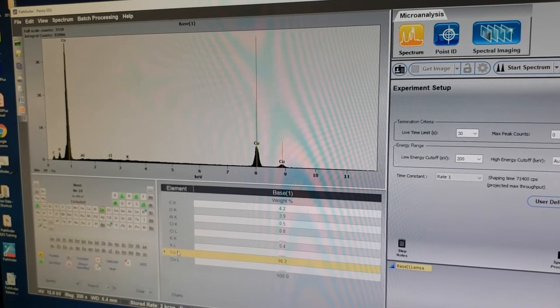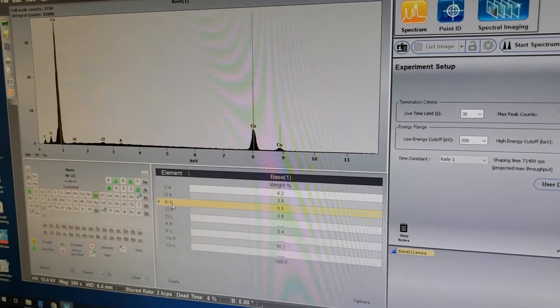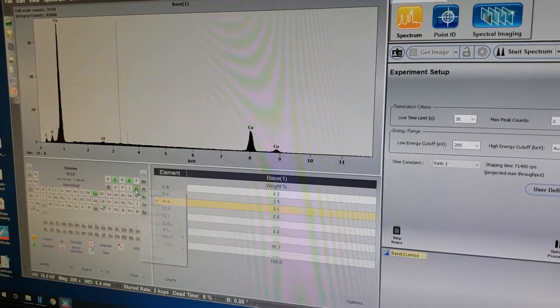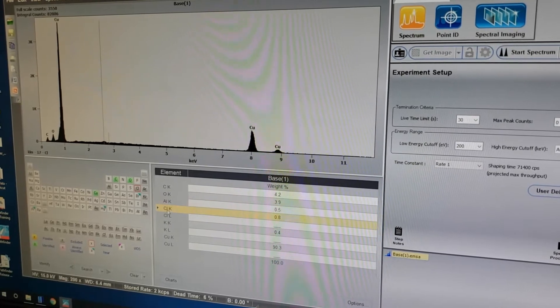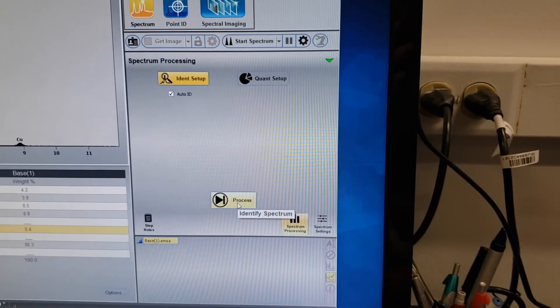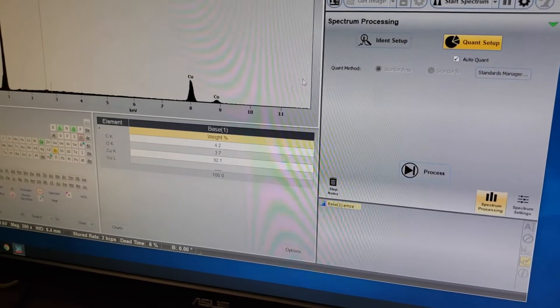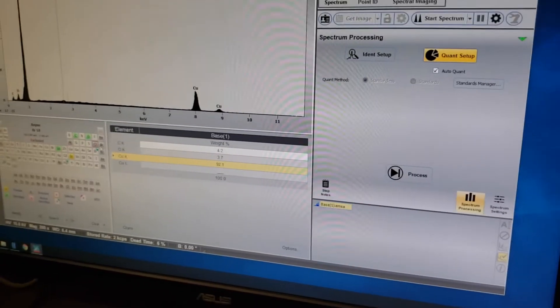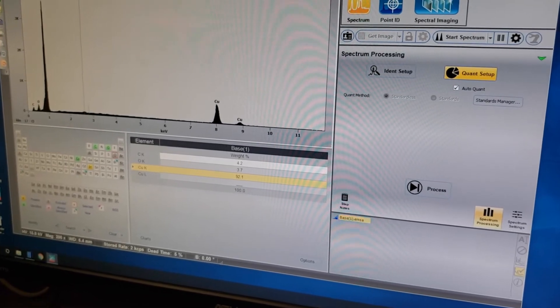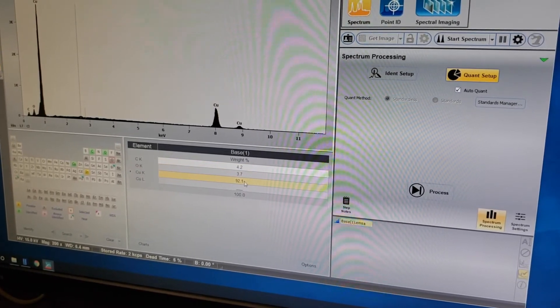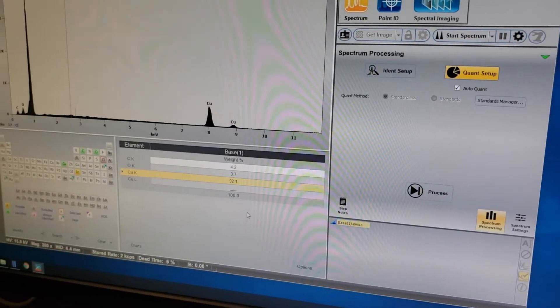Copper looks great. If you wanted to keep those trace elements out of the equation, you could exclude aluminum, exclude potassium, and exclude chlorine. You'll notice that does not remove them from the table — you need to go to Spectrum Processing and click Process. That reprocesses the table and now it has removed those three excluded elements, redistributing weight percent and giving a little more weight to copper.